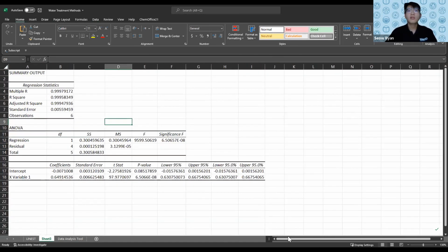So over here, you can see a lot of other values that LINEST doesn't tell you. LINEST is usually sufficient if you just need to know those values that I highlighted earlier. The regression add-in from the data analysis add-in tells you a lot more information, such as the p-value of your intercept. This is particularly interesting because it tells you whether the intercept is 0 or not, which might be important in certain cases, where say your intercept is supposed to be 0. You can find out more about this. Not going to tell you too much.